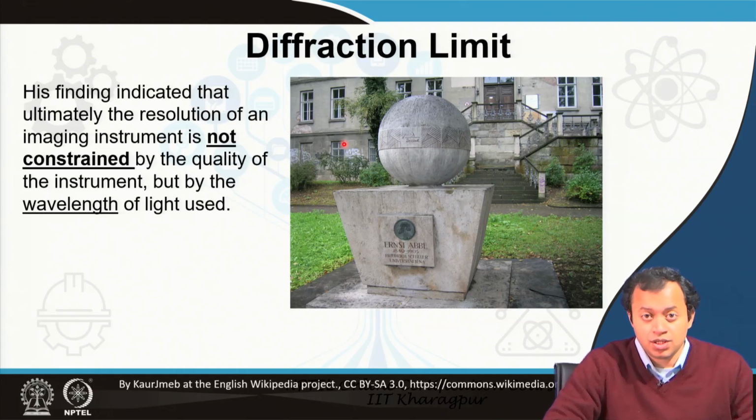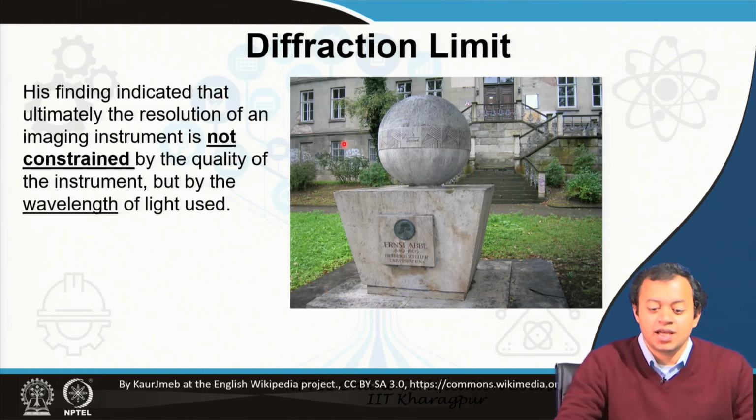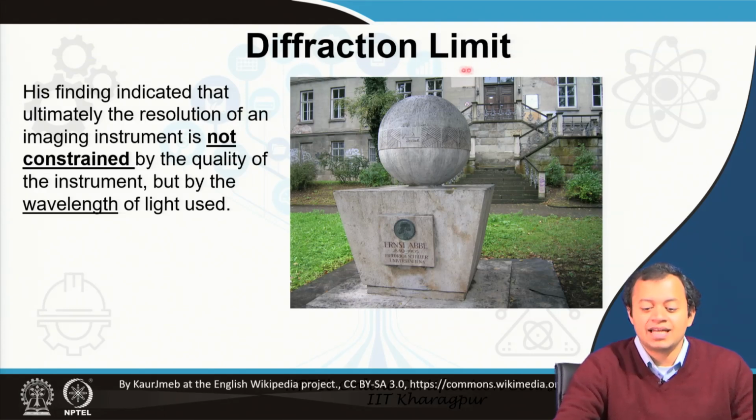Photonics technologies break this limit. In my opinion, the most significant achievement of photonics-based optical imaging techniques is that we can bypass the diffraction limit and image one single molecule using light beams which are not twice, but 10 times, or if I may be a little boastful, 100 times larger than its size.